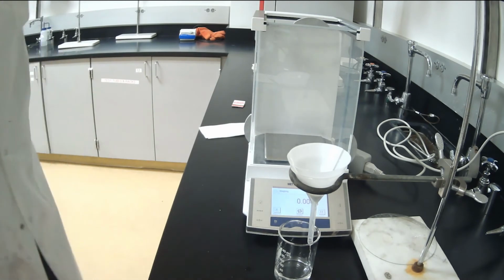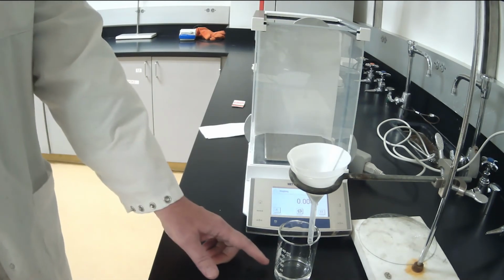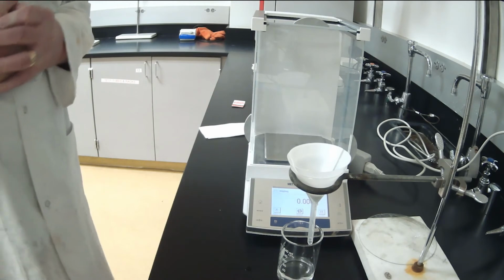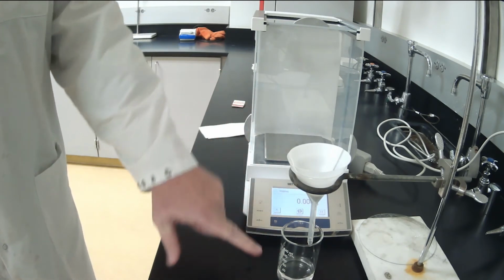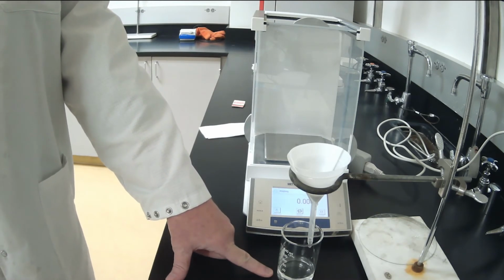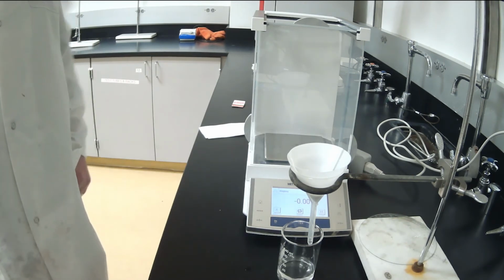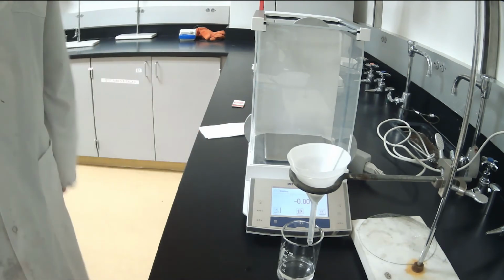Alright, and now we're just going to let it drip, or continue dripping, until we don't see it drip anymore. Now that we've done that, in theory, with 3 rinses, all of the sodium chloride should have been removed, and hopefully will end up down in the filtrate in this beaker, which we weighed previously. So we're just going to wait for this to drip, and then our last step is to remove the one impurity left. So what impurity is left in our compound?